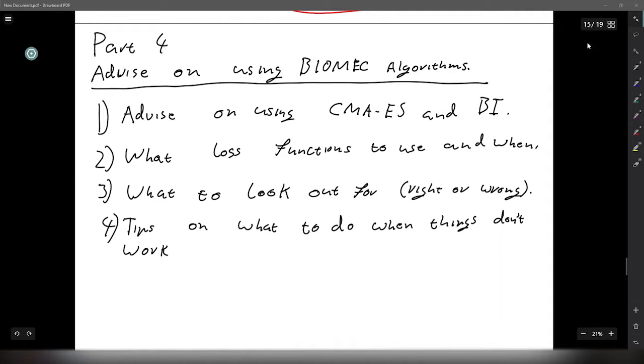Part 4, I'm just going to run everyone through some advice on using BIOMEC algorithms and BIOMEC in general for optimization of the MECSim. I'll probably put anything else I've forgotten in the other videos. It shouldn't be much. This will be quite a quick one, but I'll give you some advice on using CMA-ES and Bayesian Inference, what loss functions to use and when, and what to look out for, right or wrong, in analysis, and tips on what to do when things don't work.